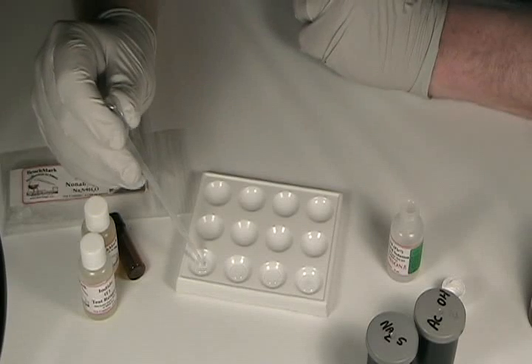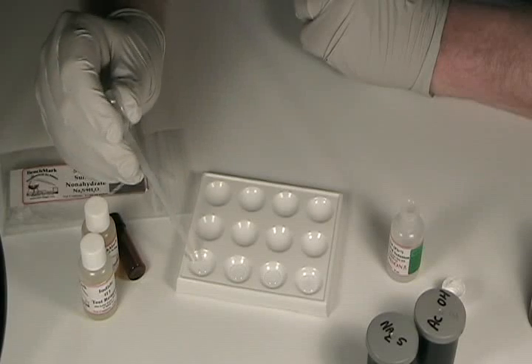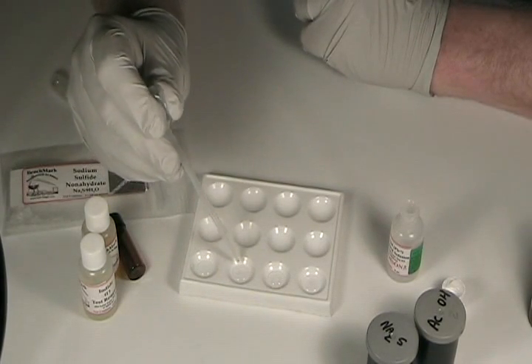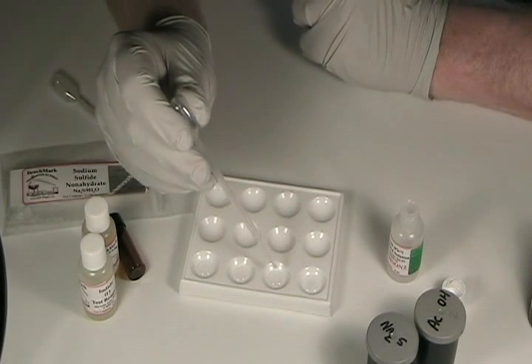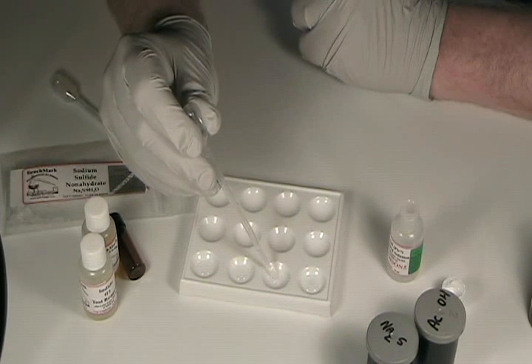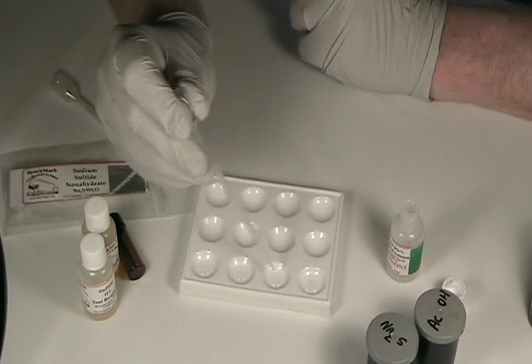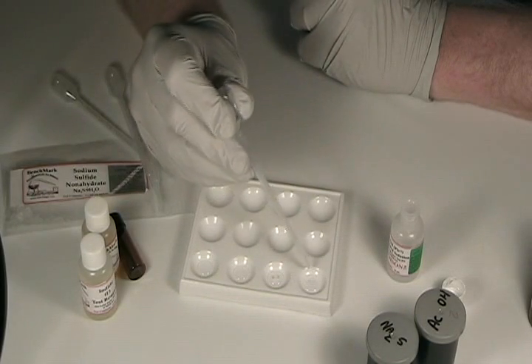Now I'm going to withdraw one drop and put it in the second well, returning the rest to the first well. Stir it around and draw it up — there we have our 500 parts per million lead solution. I'm going to transfer one drop of that to the third well and mix it up. That gives us our 50 parts per million lead solution. Transfer one drop to the fourth well, and that gives us our 5 parts per million lead solution.